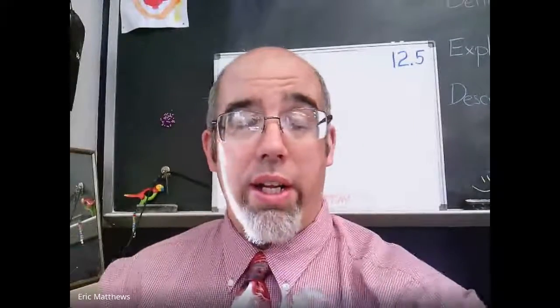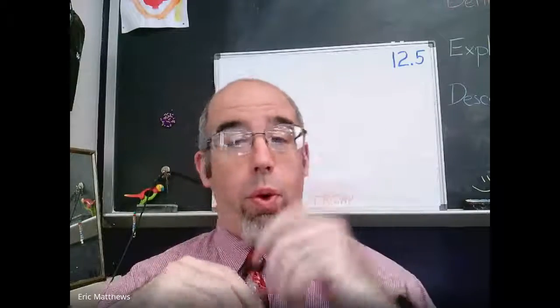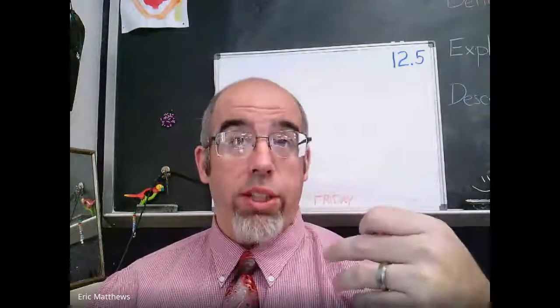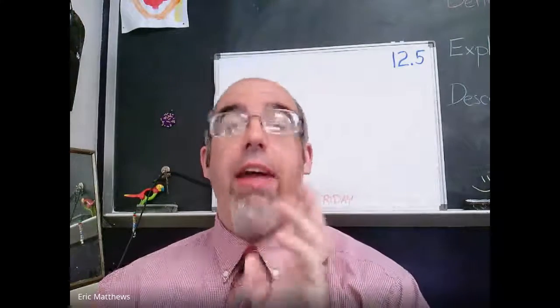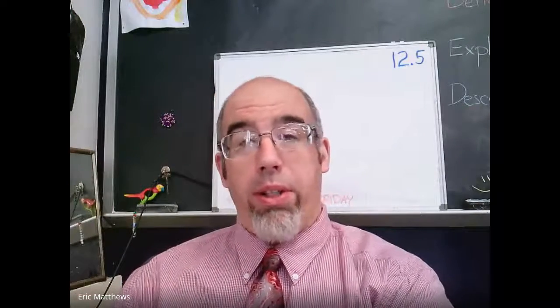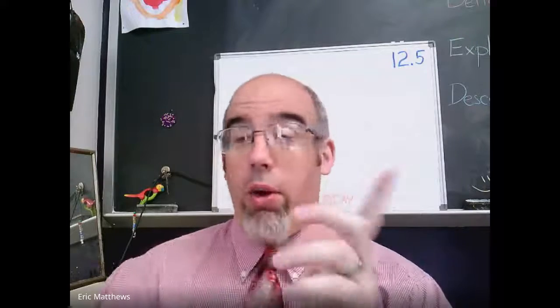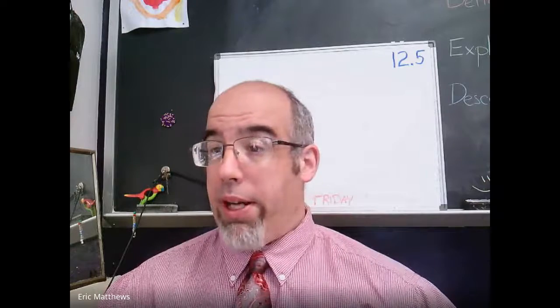And good morning. It is our first day of New York State Lab number 4, Biodiversity, and I want to make sure to spend a little bit of time today going over what we're going to work on here in class, which is going to be the physical characteristics of the plants. And then in the next few days, we'll work on the chemical comparison between the plants. But today we're going to have everybody do the physical, so that's really going to be the focal point. So there's a couple of things that I would like to show you so that everybody has a better idea.